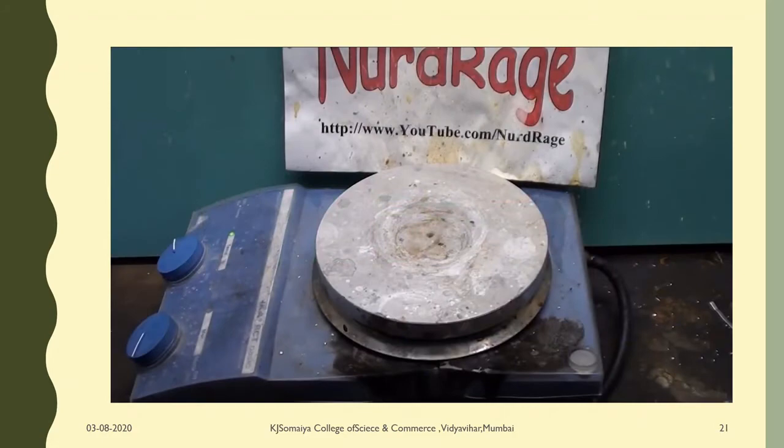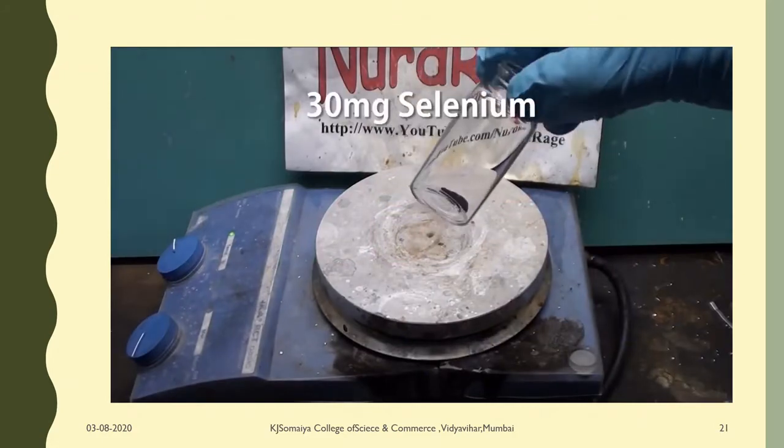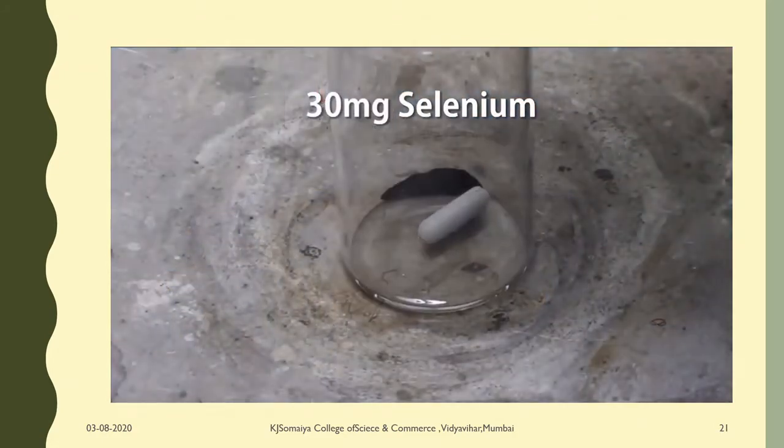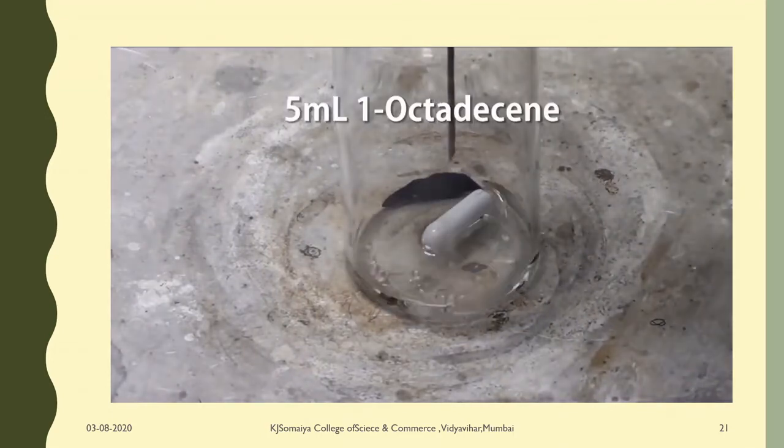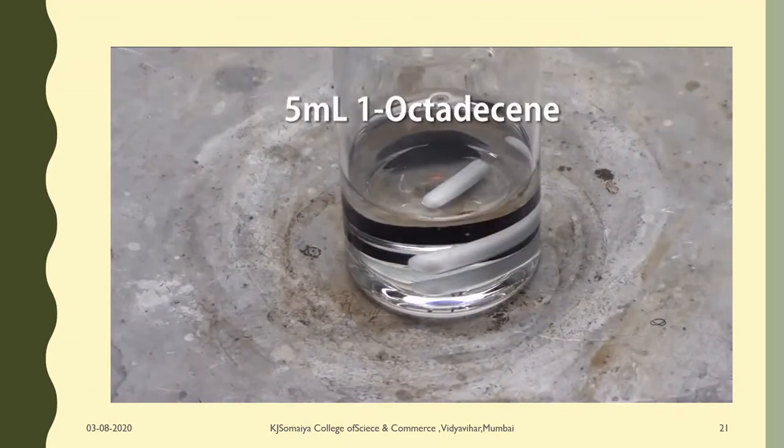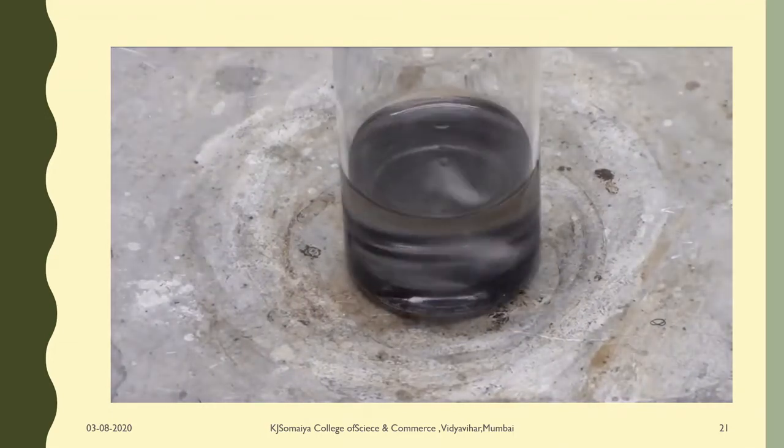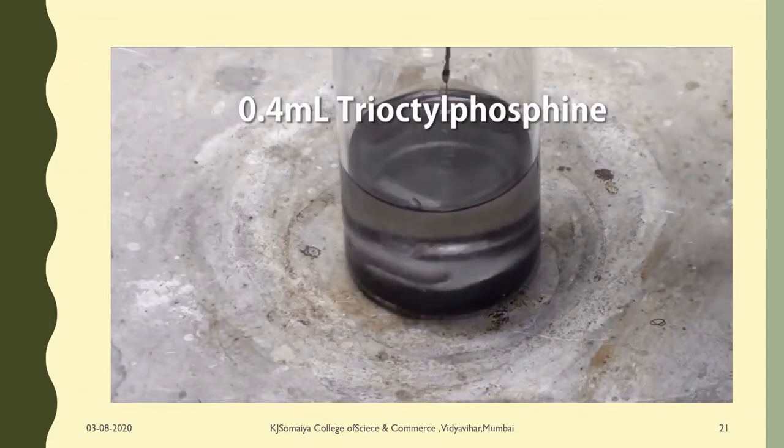First we need to make our source of selenium. Get 30mg of pure selenium powder and add to it a stir bar. Then add in 5mL of 1-octadecene and turn on the stirring. Now add 0.4mL of tri-octylphosphine.